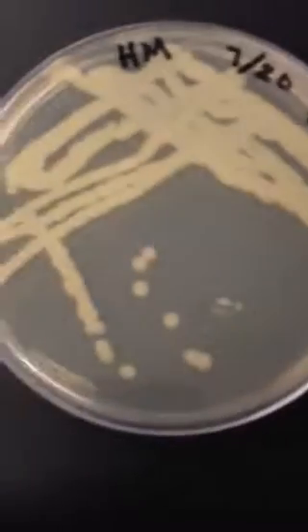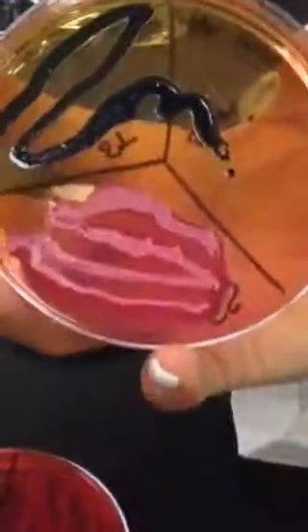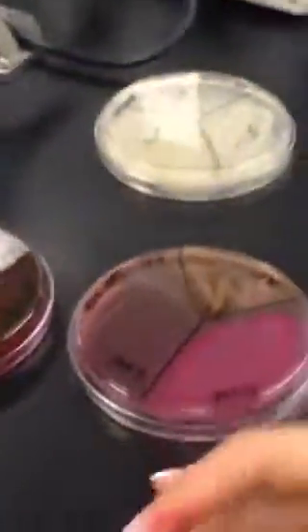Also from here, the SS agar is very specific for salmonella. If it came out black, it's salmonella. Proteus also, if it came out black, it could be Proteus. I doubt highly that the lab techs would have given you Proteus.